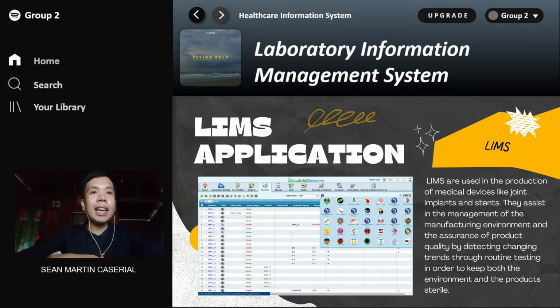Next is the LIMS application, or the Laboratory Information Management System application. So LIMS are used in the production of medical devices like joint implants and stents. So why do we say that it is used? Is it used only in managing information inside the institution? No. LIMS are used in the production of medical devices like joint implants.